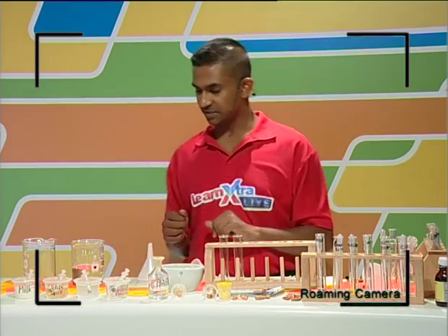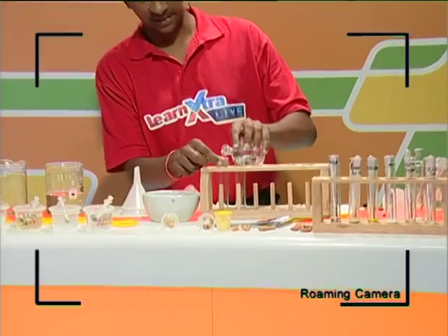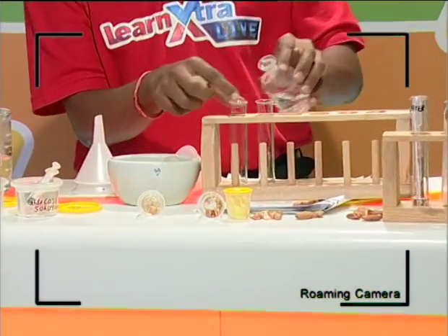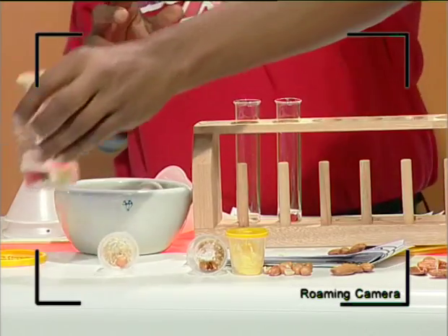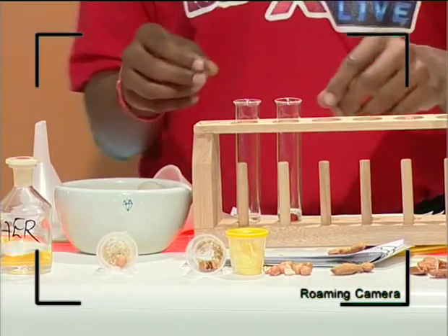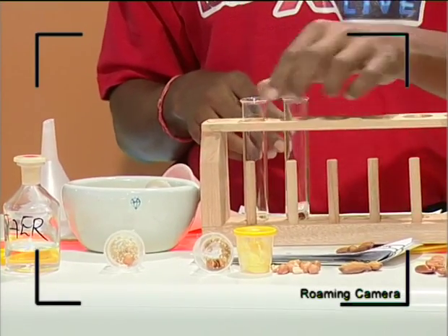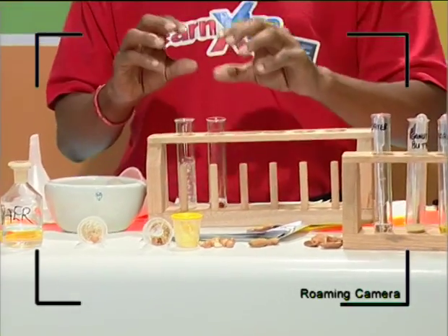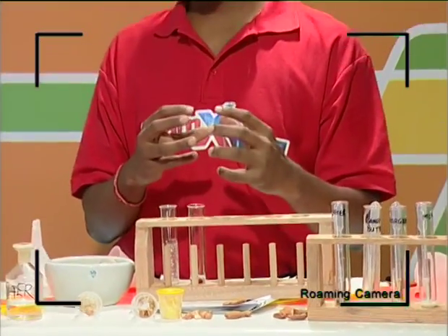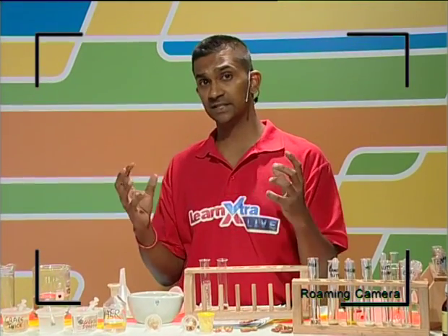These will then be treated with ether. We're going to put a little ether into each one of them, guys. Remember that your fats are soluble in ether, and this will break up the ester bonds that hold the building blocks together. We're going to give this a gentle stir and leave it to settle for a little while. In the meantime, the ether will react with the fat molecules and split them up, separating the glycerol and the fatty acids.